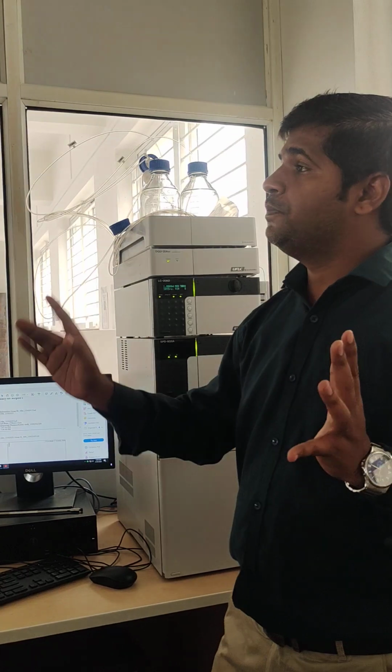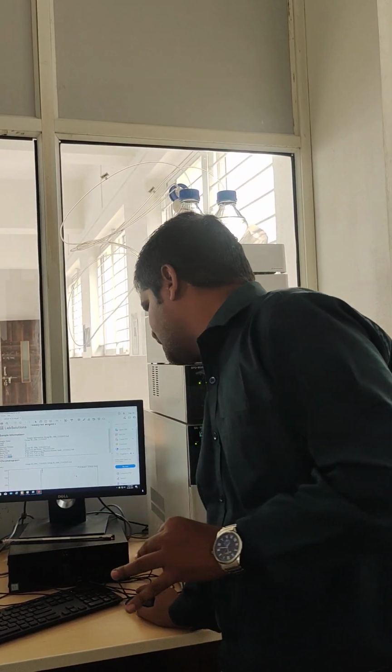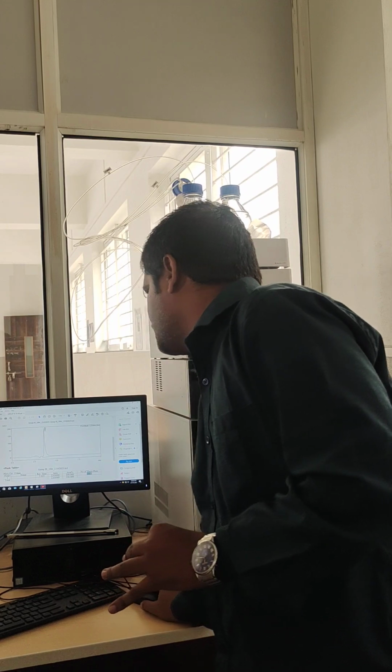And how many theoretical plates should be there when we tell it is a good instrument and it is working at normal condition? So theoretical plates should be more than 2000. How much? More than 2000. Then only that procedure is accurate and we can analyze. How much here are we getting? 6,862.